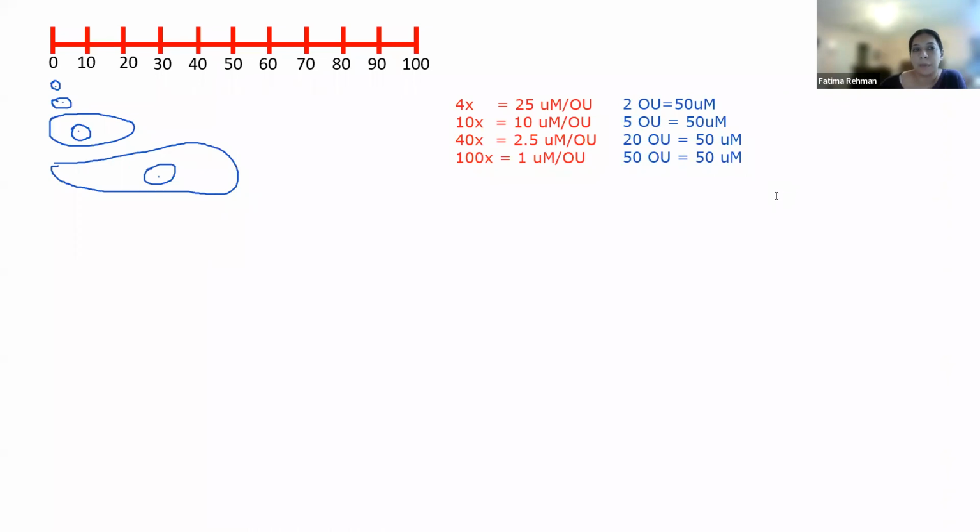Cool. Everyone good so far? Okay. So when we are using our microscopes in the lab to measure cells, these are the calibrations that you're going to use. And this is how you would be calculating the sizes of different structures or cells, nucleus, maybe size and length of projection, whatever it is that you decide to make your observations on, right? Today, we are not gonna have the microscope, so we don't have an ocular micrometer, we don't have that ruler, but we still need this calibration.